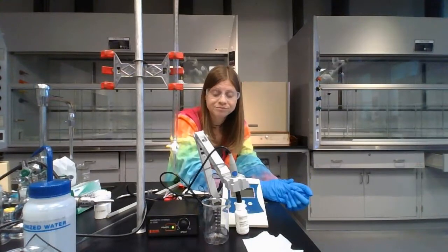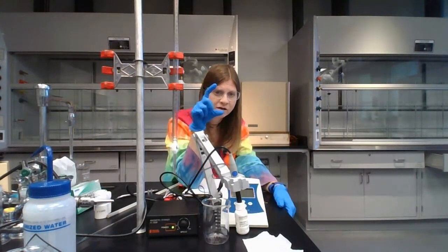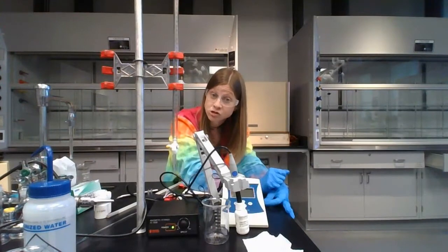Now trial 3, once you're finished with trial 2, you'll take out your stir bar, fill up your burette, start it over again. You're pretty much going to repeat what you did in trial 2 in trial 3. Now, depending on if you really did learn something about where your equivalence point was, you might be able to narrow that 2 milliliter range of the 0.1 milliliter increments down to 1 milliliter range. I would suggest talking to your instructor before doing that, just to make sure.